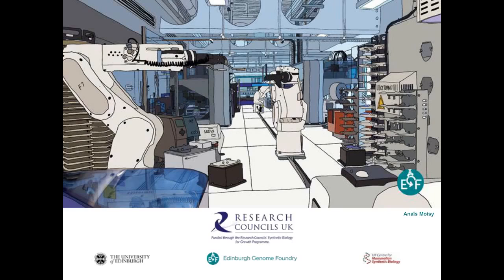What ligase and buffers do you typically work with? Oh, those are fairly bog standard. The ligase reaction for the Golden Gate that we described uses standard T4 ligase buffer. I believe we get that from NEB. And again, it's a very bog standard T4 ligase. It's not even the quick ligase. It's just the regular cheap stuff.